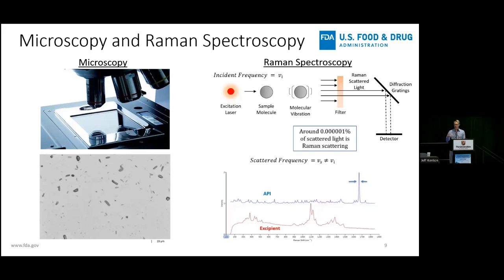So you can see, there's tons of different shaped particles: elongated ones, short round ones, dark ones, light ones. You're not really sure what everything is. This is where Raman spectroscopy comes in. And you can actually shine the laser right through the objective lens using a confocal arrangement.